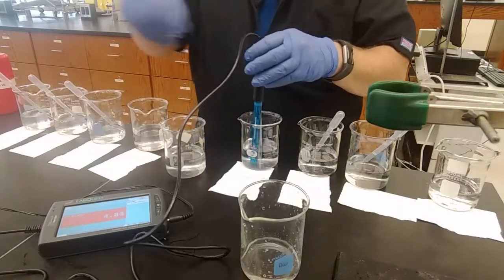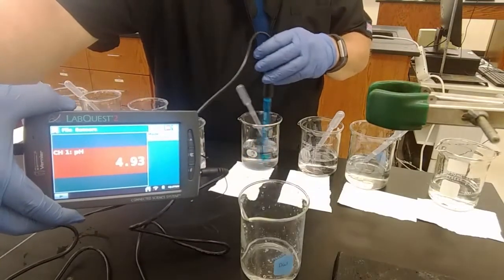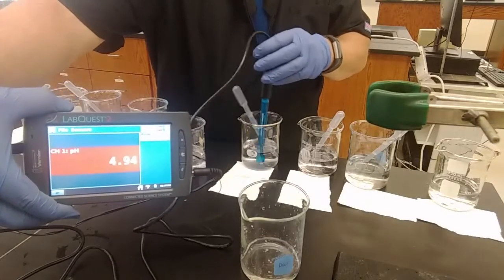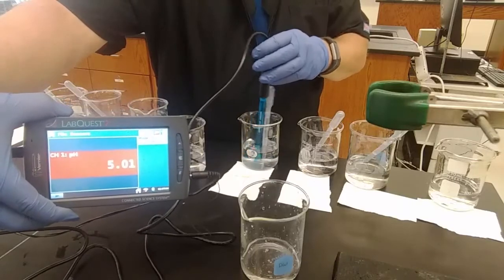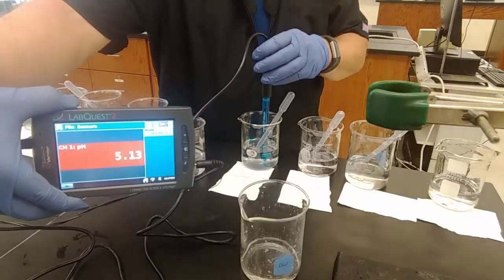Oddly higher. 4.85. This is why you always need to calibrate your instruments and maybe use more than one instrument, which is what this lab is. We're going to measure the pH of these things multiple ways and see what we get.